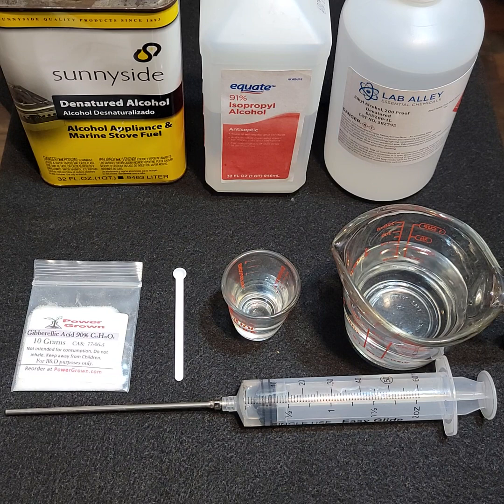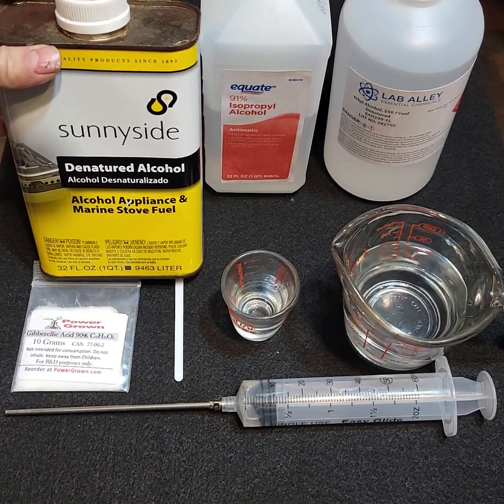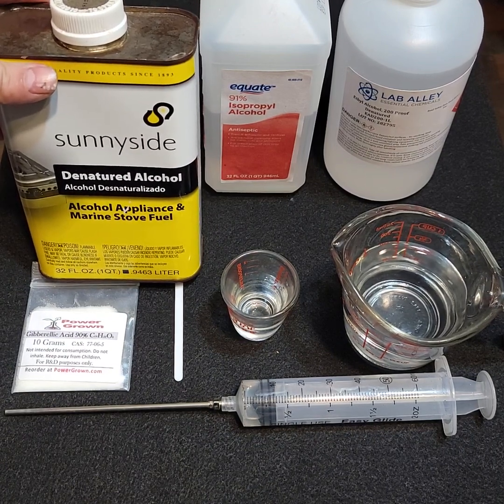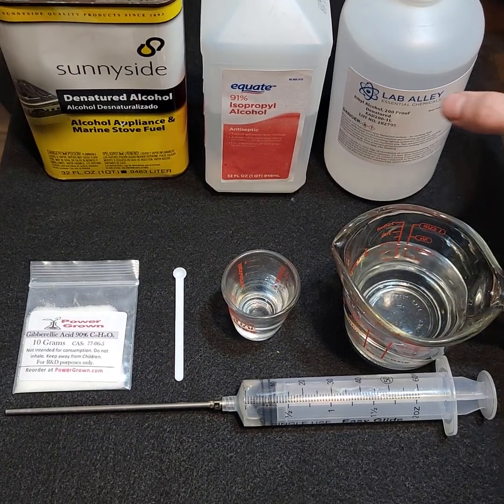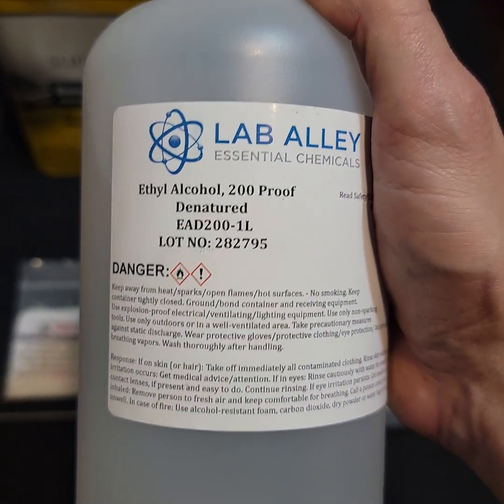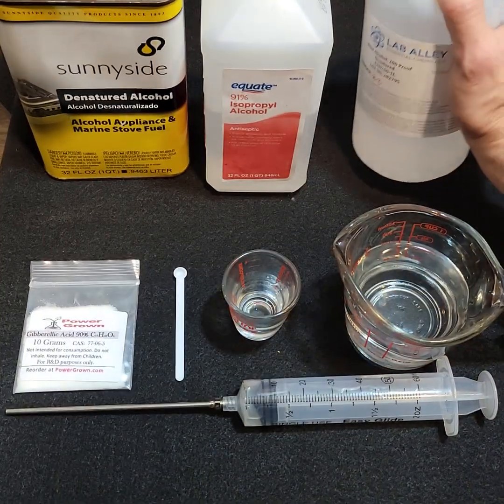I'm using denatured alcohol which I picked up from Home Depot — this is just ethanol with a bittering agent, denatonium benzoate, added to it so that people won't drink it. I also have some denatured alcohol 200 proof that I picked up from the Lab Alley website. That works — it's the same thing, just a different container.